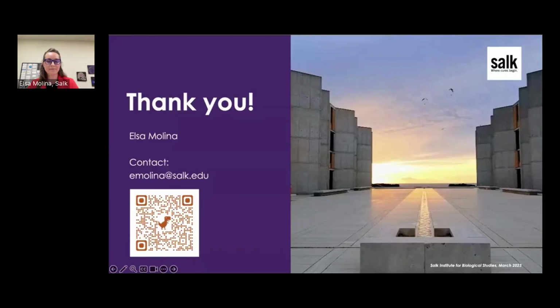And a really great question that we've had here, I think will tailor to your experience with so many different technologies, is how does sample preparation impact the quality of your spatial transcriptomics data, and what are some best practices or tips for the different tissue types?